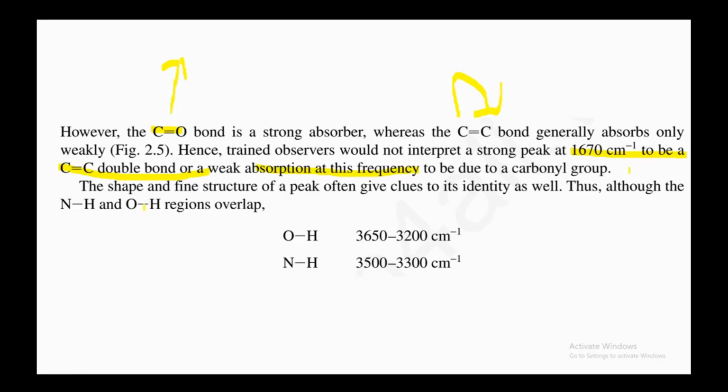The shape and fine structure of a peak often give clues to its identity as well.